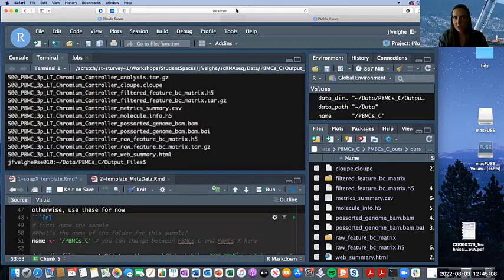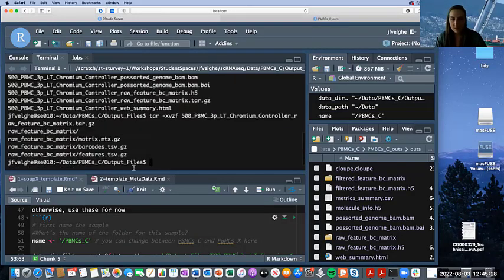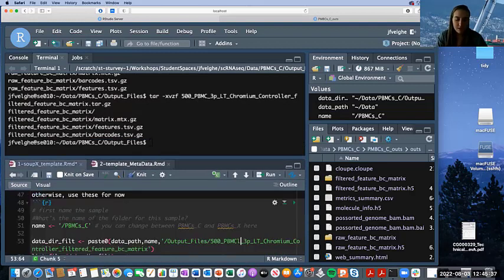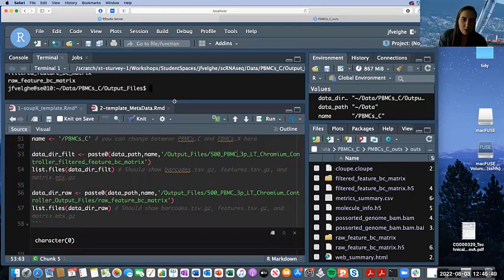And now we're going to run what Alejandro put in the chat to unzip these files. Tar dash. I don't have access to the Zoom chat, so I wasn't in the chat. So tar -xvz, the two files you want to unzip, and let that unzip. Okay. So now we should be able to see them when we hit ls in our folder, and then in the code down below. So we see them here. So in the code down below, now that they're unzipped, we're going to.